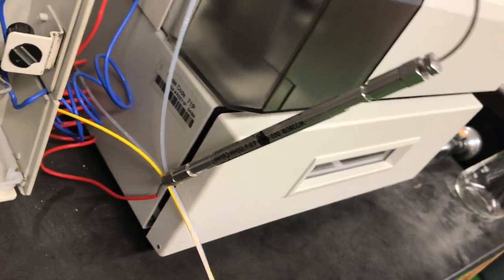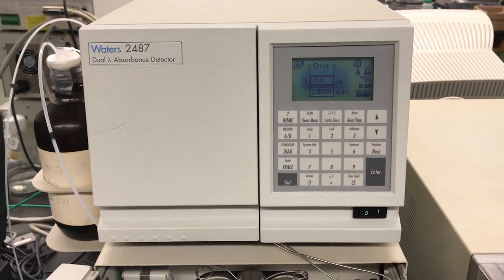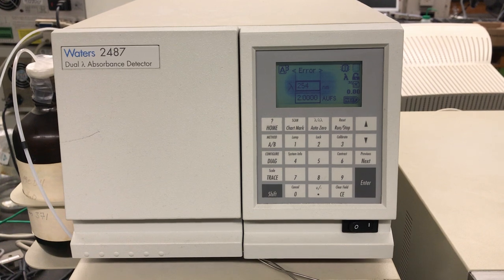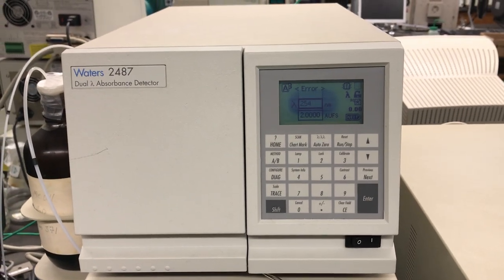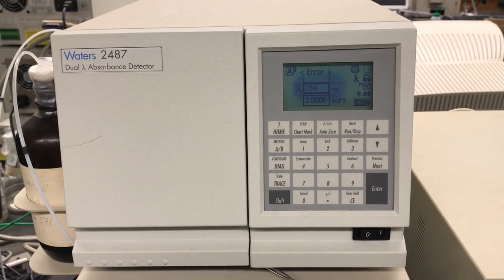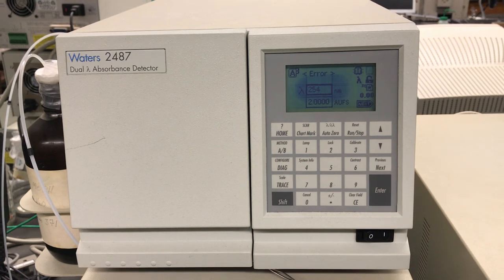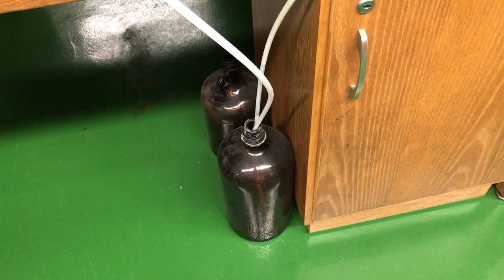Once separation occurs, we have to detect the components coming off of the column. We're using the Waters dual wavelength absorbance detector, which is essentially a simple spectrophotometer. It has a deuterium source because we're primarily working in the ultraviolet part of the spectrum, where most organic compounds absorb. Inside is a small-volume quartz flow cell through which the mobile phase and mixture components pass, allowing us to determine the absorbance of each component. At the bottom, we have a waste reservoir that collects everything coming through the system.